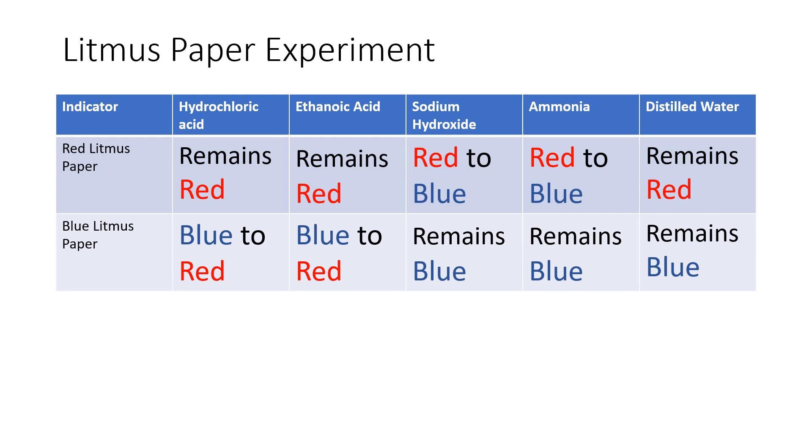Conversely, when we put sodium hydroxide or ammonia on the red litmus paper, they become blue. And when we put them on the blue litmus paper, they remain blue.